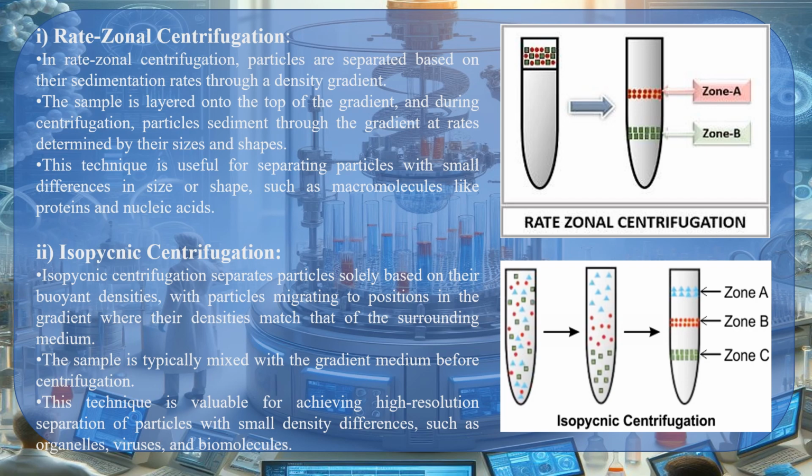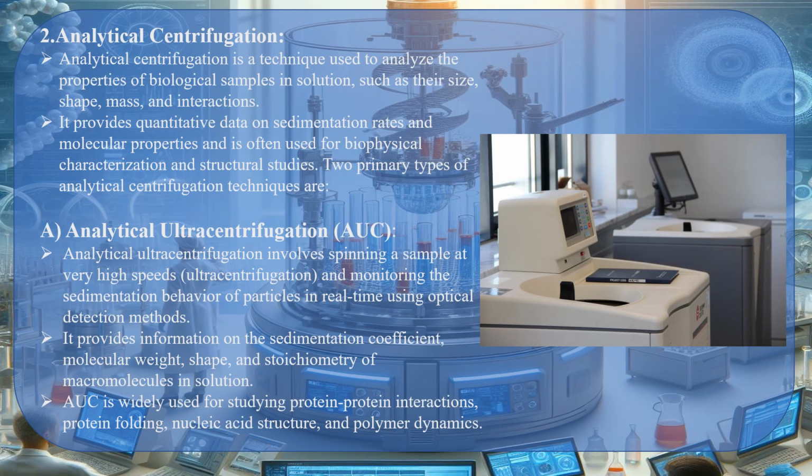The particles separate solely based on their buoyant density, with the particles migrating to the positions in the gradient where their density matches that of the surrounding medium. This technique is valuable for achieving high resolution separation of particles with small density differences, such as organelles, viruses, and biomolecules. Next is analytical centrifugation.